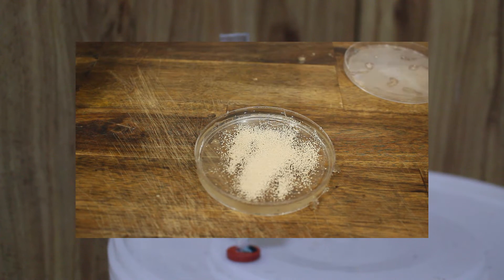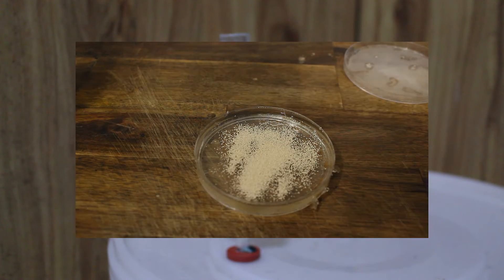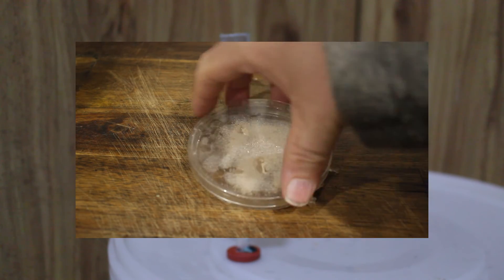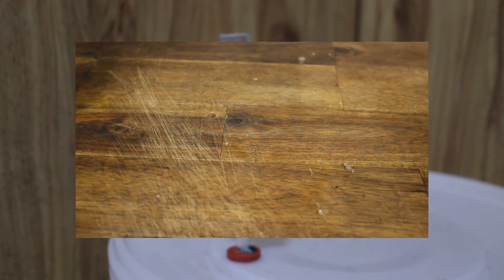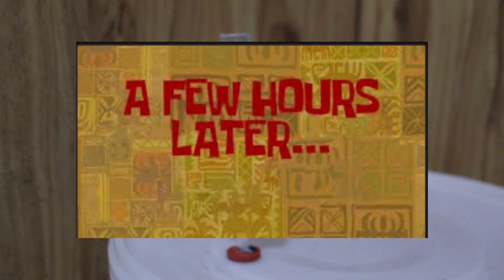Simple but enough for the yeast to get it started, and that's the key here. Now that we add the powdered yeast to this, a light sprinkle over the surface, this should create a wide mass of yeast colonies within a day or two, certainly not very long.